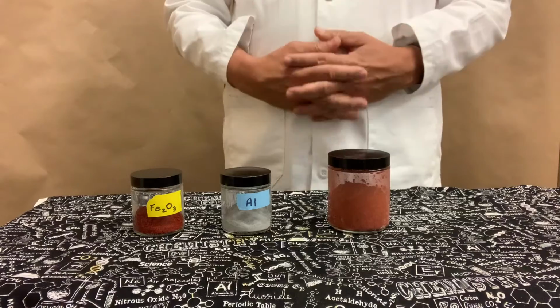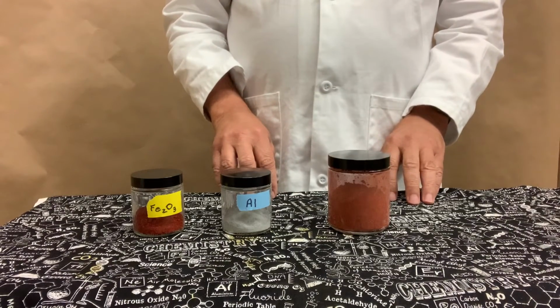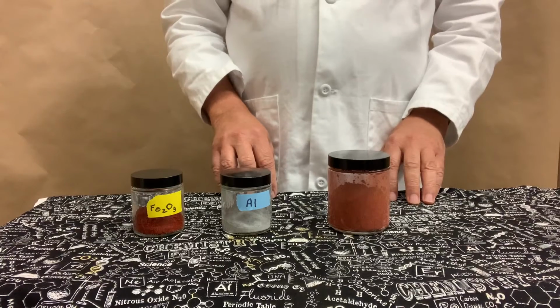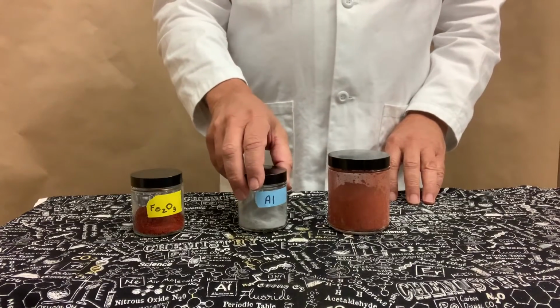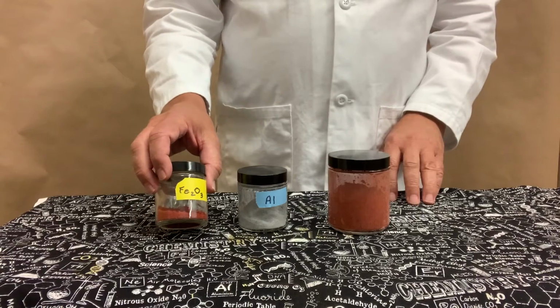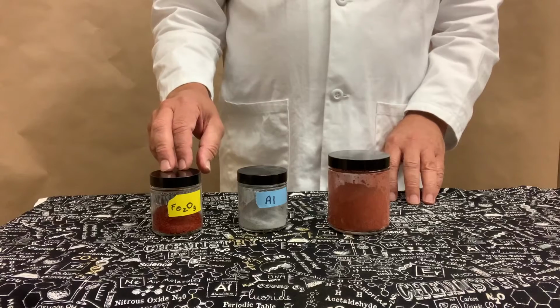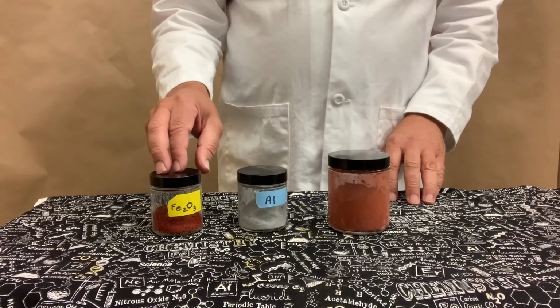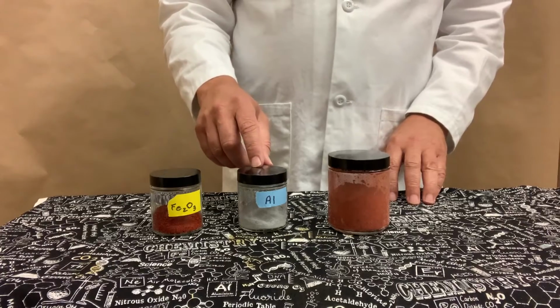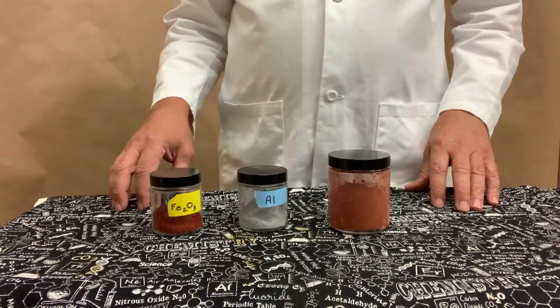Hi, today we're going to be doing the thermite reaction. In the thermite reaction, the aluminum displaces the iron in iron(III) oxide, resulting in a single displacement reaction, so we end up with iron and aluminum oxide. It's a very exothermic reaction.